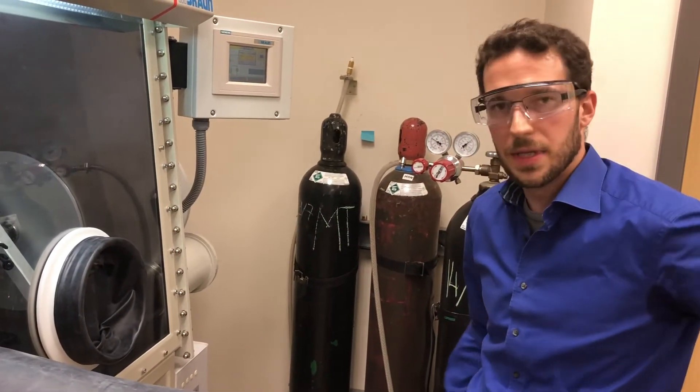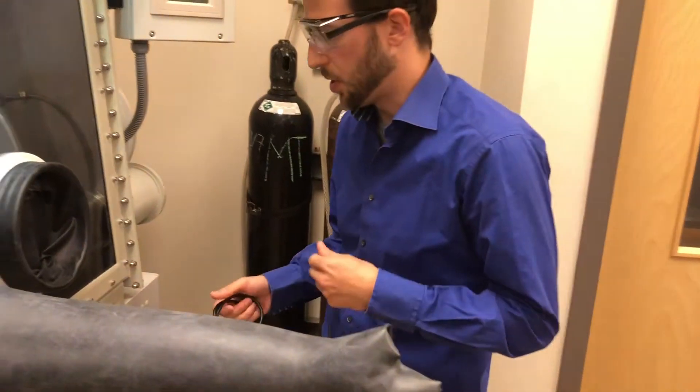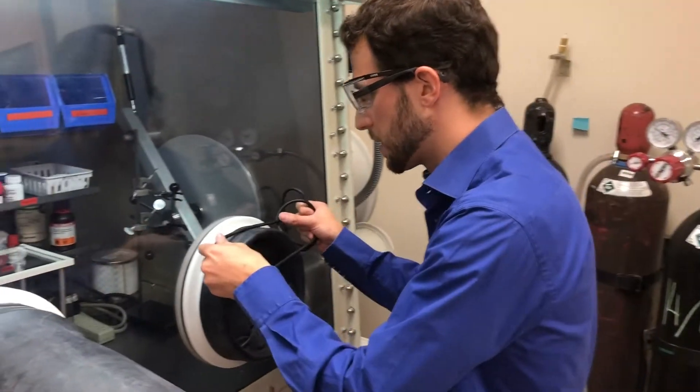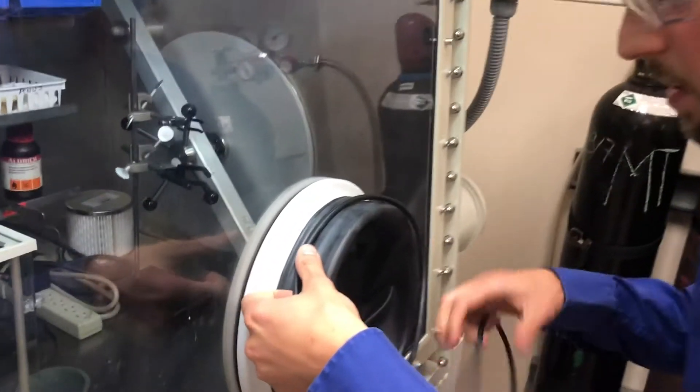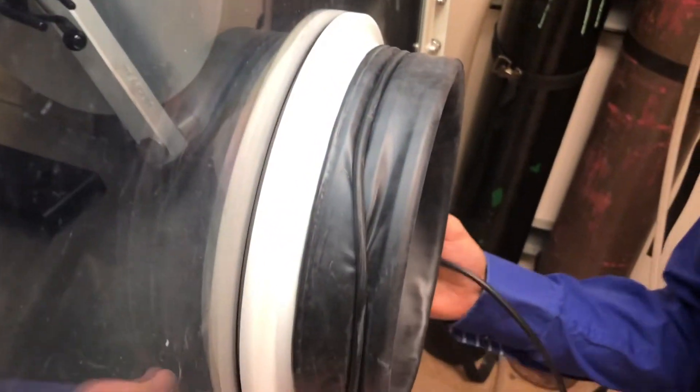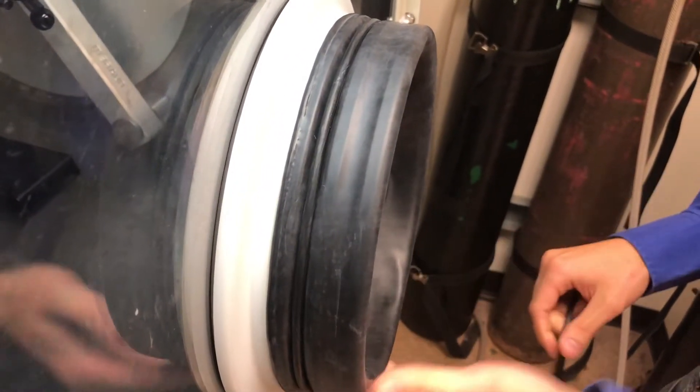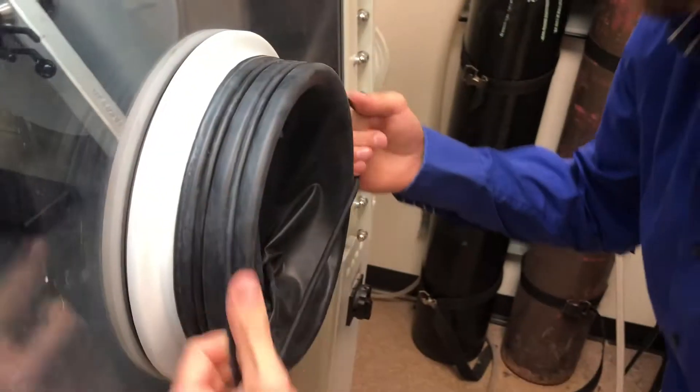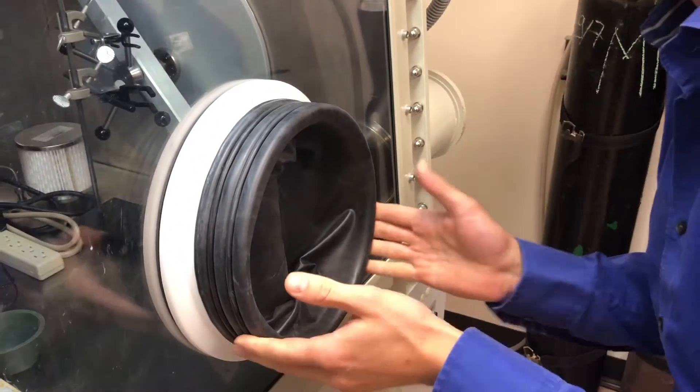So finally you take the two rubber o-rings. These are new ones and put them in the two other creases. Like so.